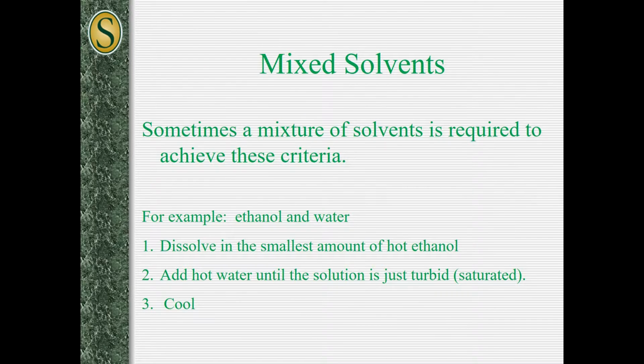Okay, sometimes to recrystallize, you might need a mixture. Remember, in this experiment, we are only using H2O. Sometimes you might need a mixture. For example, sometimes you might need to mix some H2O with some ethanol to get the right temperature coefficients. Okay, but today we don't need to do that.